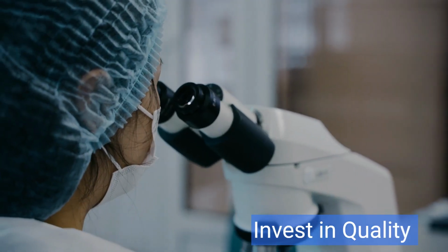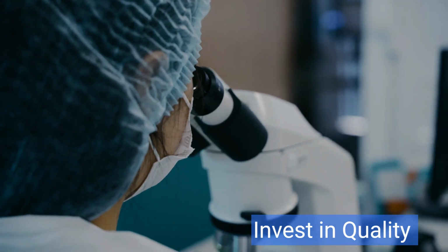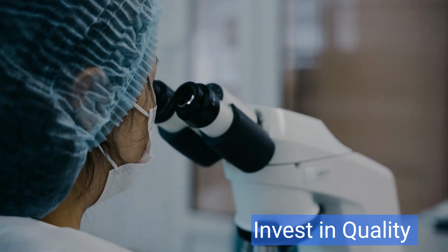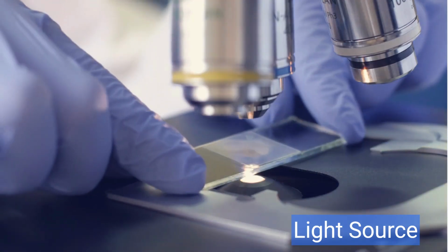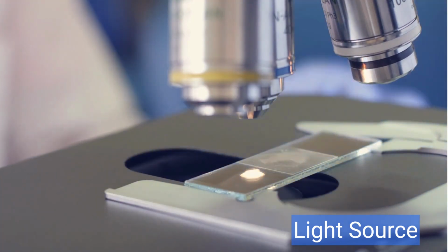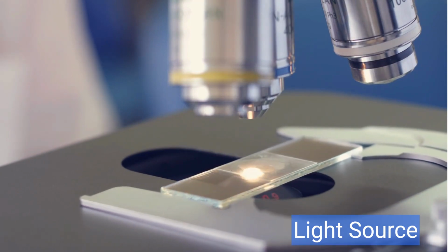Step 4. Quality and brand. Invest in a reputable brand known for producing quality microscopes. Quality optics and construction will ensure clear and accurate results. Step 5. Light source. Microscopes can have different lighting options, such as LED or halogen. Choose one that suits your preferences and lighting conditions.